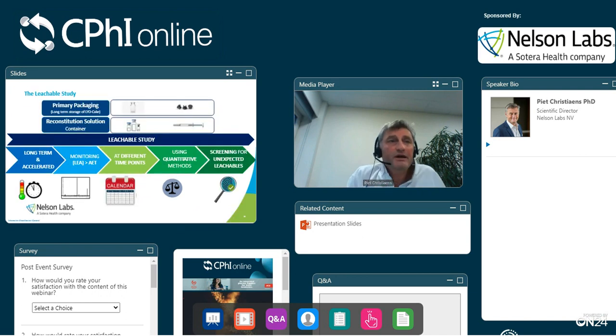For the leachable study, you're looking at both a combination of long-term and accelerated condition. What the authorities always ask is the long-term stability, but if you would like to speed up your submission, it is possible to take the accelerated conditions and submit that first, as long as you then afterwards submit the long-term stability results also to the authorities. Of course, here also the AET plays a role. Everything that is above the associated AET for your drug product needs to be identified and quantified.